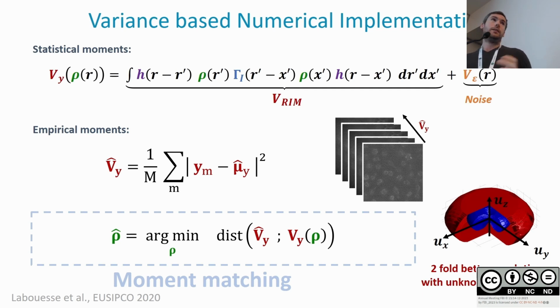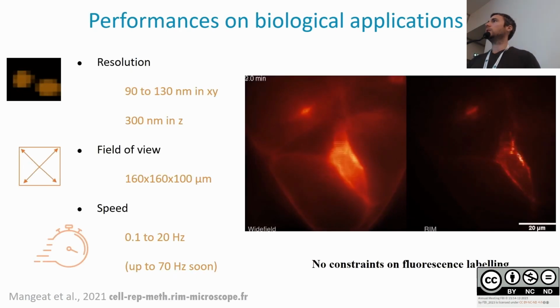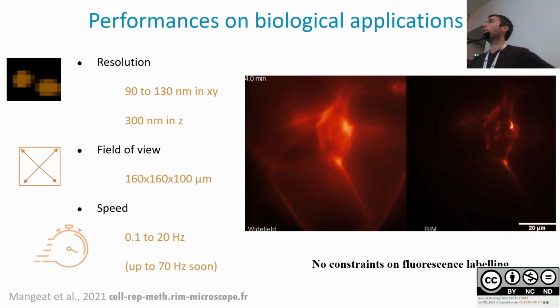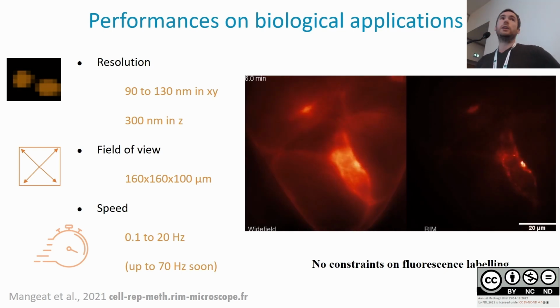So that's theory, but then we did quite a broad study of the behavior of this algorithm in simulations, and now it's commonly used in the microscope, used a lot for different biological applications.